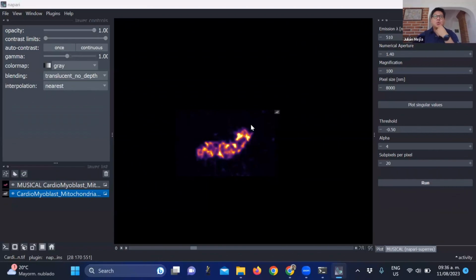The thing that you do is you go to the microscope with your sample, and you take images of the same sample at different times, and that is what we are providing. That is what we call the movie, or the stack in time. So it's 2D images, it's not 3D. That's correct. Thank you very much.